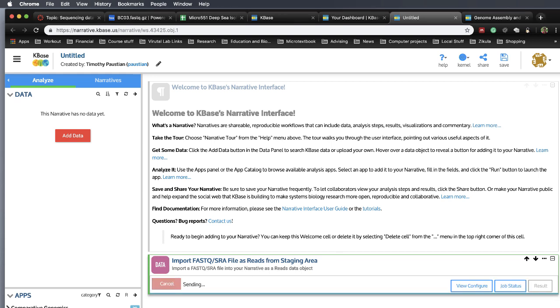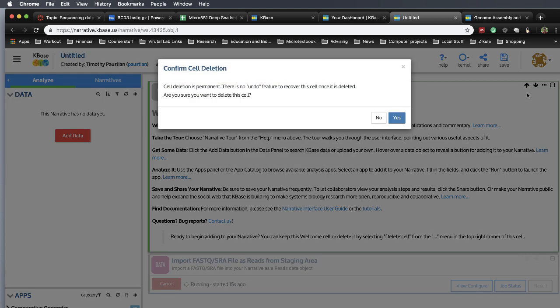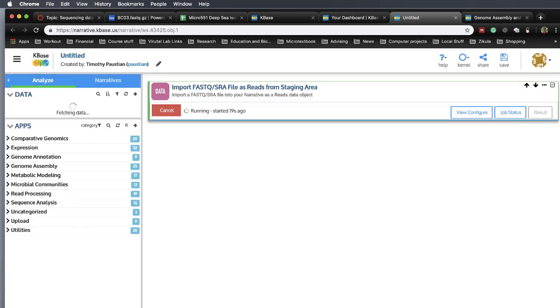It gets sent over to the server. Server launches, queues it, and pretty soon it will run it. And if you want, you can get rid of this welcome message. Just come up here, go to the narrative, this little three dots here. Say delete cell, and say are you sure, and you go yes. Okay, it's now running. And now we wait.